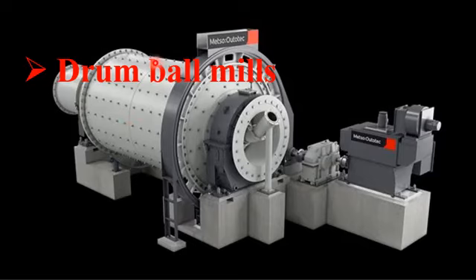Due to this horizontal axial rotation, the balls inside the drum interact with the bulk material. So the milling balls crush the bulk material into a very fine nano powder or nanoparticles. Dear student, please note that the drum ball mill is a very good machine to get very fine nanoparticles.